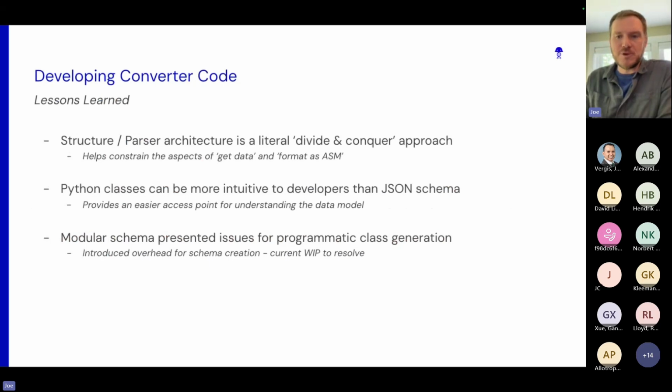This didn't come with a free lunch, though. For folks who might look at our repo, then look at the Allotrope GitLab, you'll notice that there are some differences between the way the schemas themselves are structured. This was because the utility that we're using had some trouble handling the modularized schemas, in things like the liquid chromatography schemas. This meant that we had to create more fully articulated schemas. So we wouldn't actually call them truly embedded, and this is something we are working to resolve, because I think there's a lot of value in terms of clarity, maintenance, and comparing between the two repos when the schemas follow the same pattern.